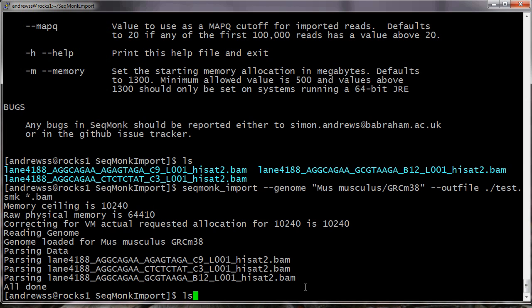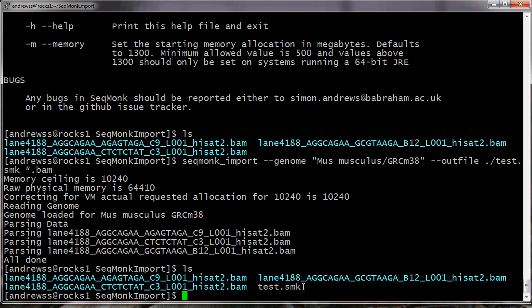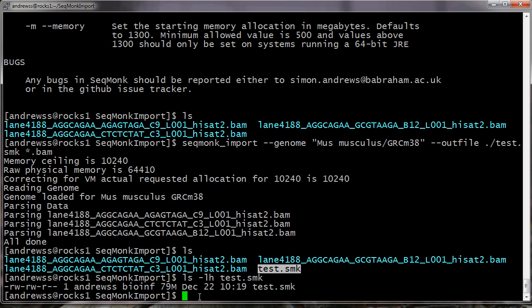If I look in the folder, I should now also see that my SeqMonk project file has been created, and that file is now relatively small, so even from these three BAM files, it's only a 79MB file that I need to transfer to my local machine to actually be able to work with it. These are very small BAM files anyway, but this will be much more compact than the size of the total files.